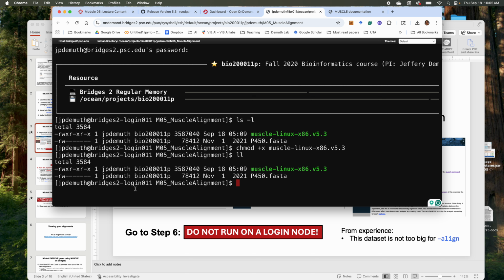This is one of those few times where I'm saying don't play with it. Most of the time, I encourage you to play with it. Not this time. That's why the PowerPoint has it as blinky. Okay, so this is the program that you're calling.